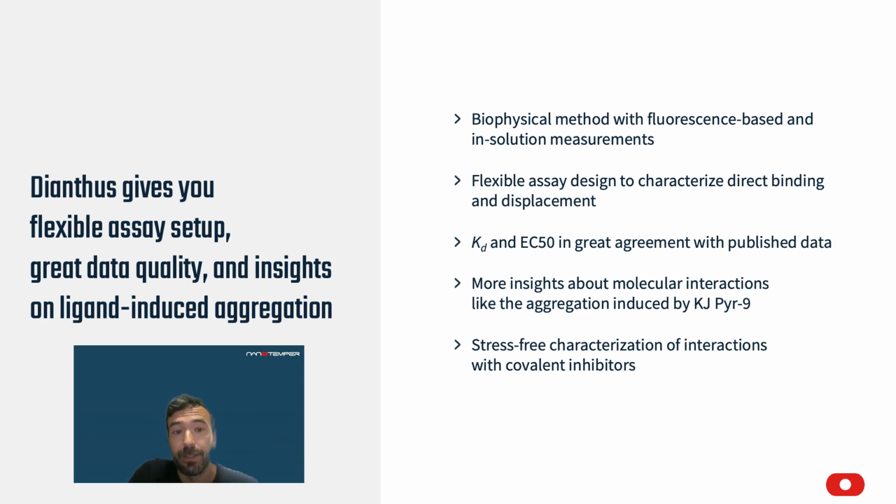All the KDs we got were in the expected range. So literature data was also always in this high micromolar range for these MYC binders. And it was very nice to see the behavior of this KJ-Pyr9 compound, that we maybe could clear up how it's working on this protein. And finally, covalent inhibitors are also not a problem. So there's no worry that you bind something irreversibly to, for example, a surface, but you can always just use new wells. So we are working in microwell plates, and every experiment is just a new row of wells. So there's no need to regenerate.